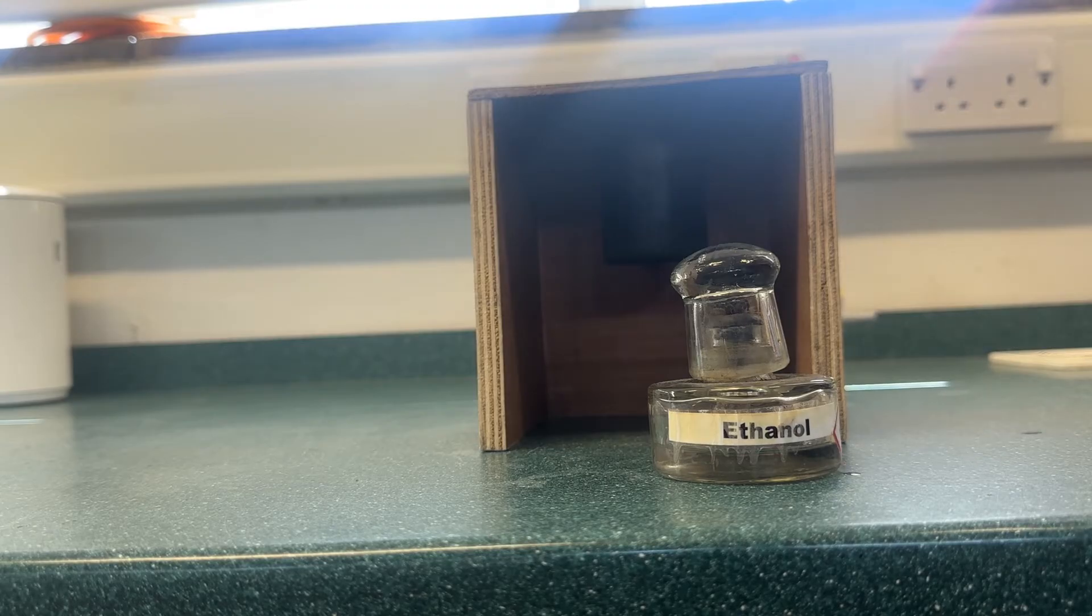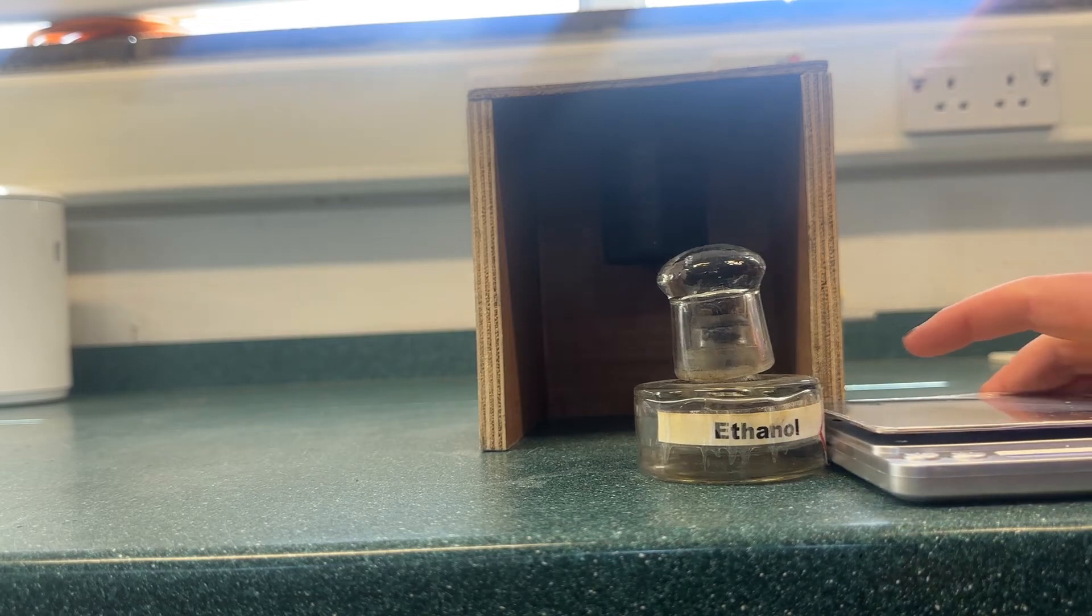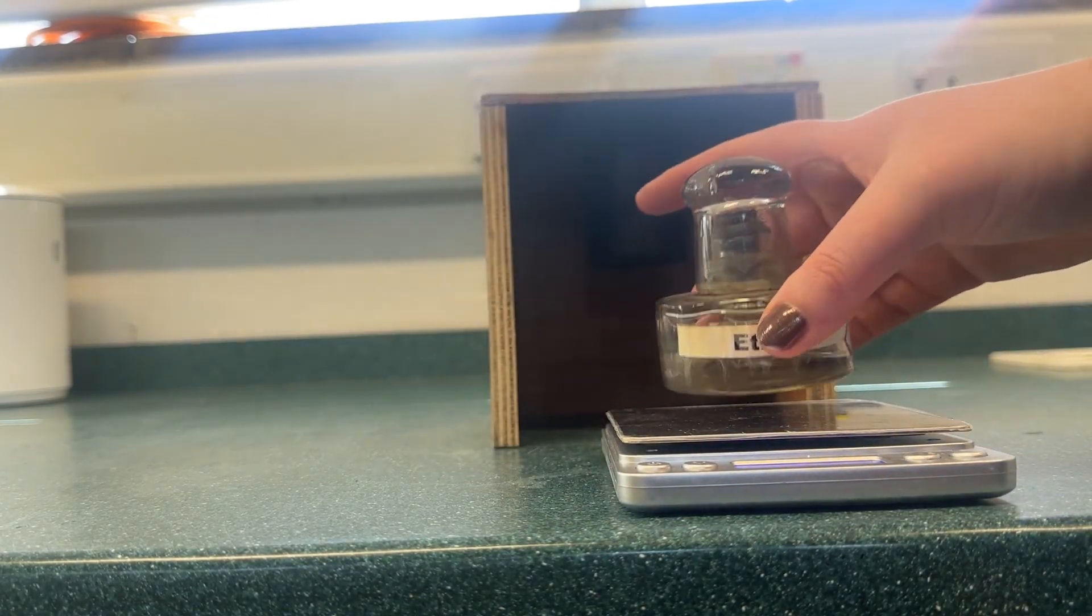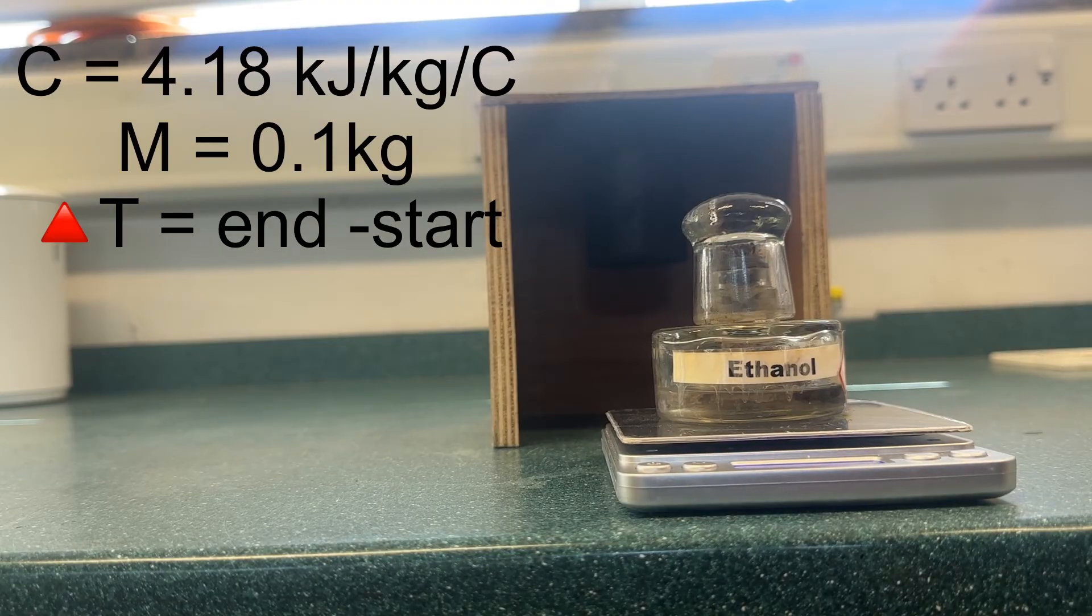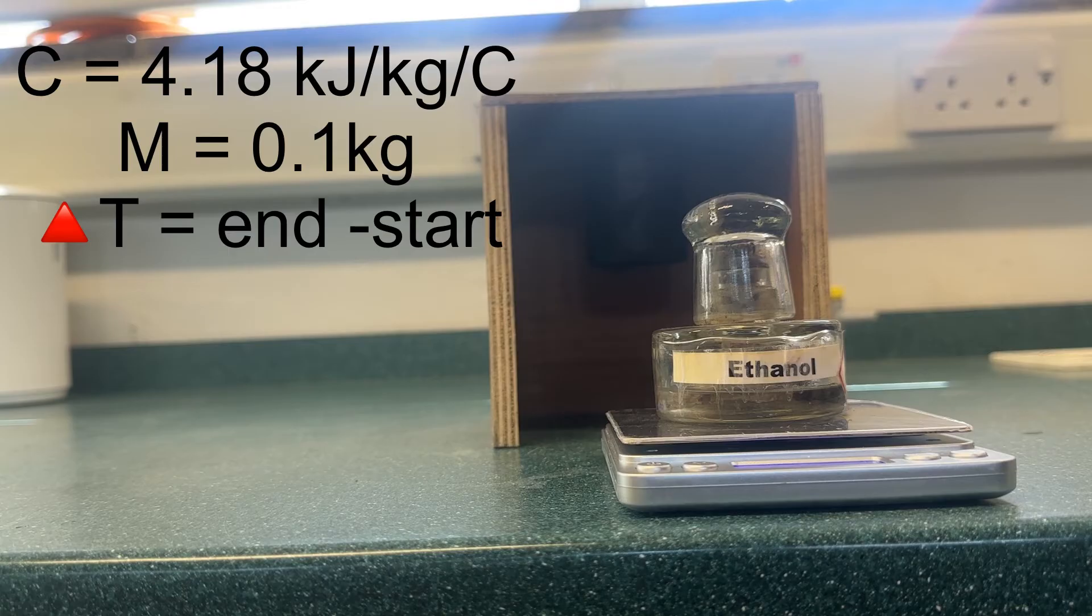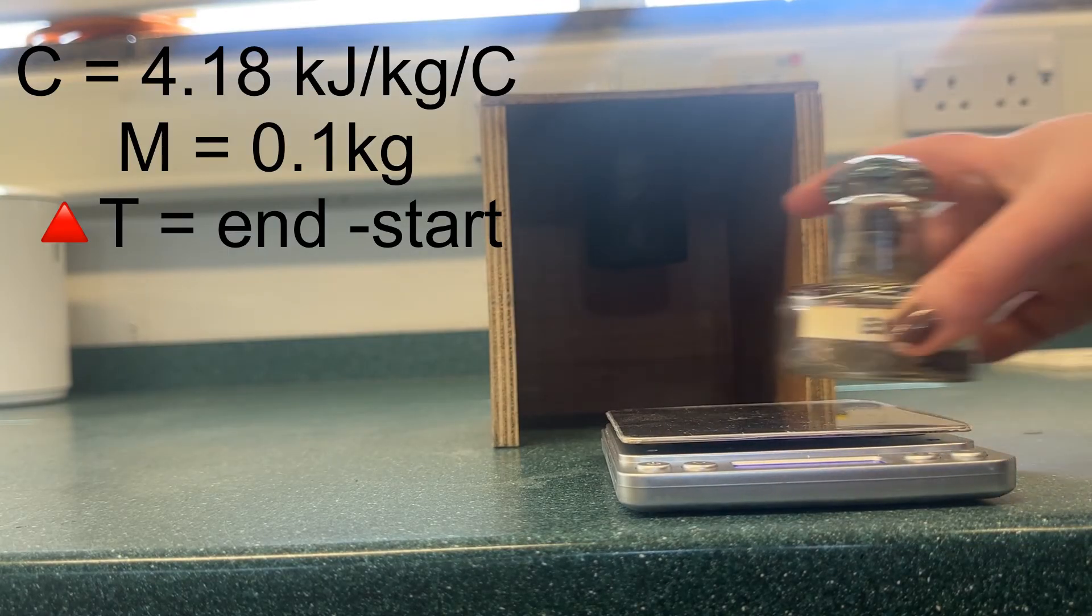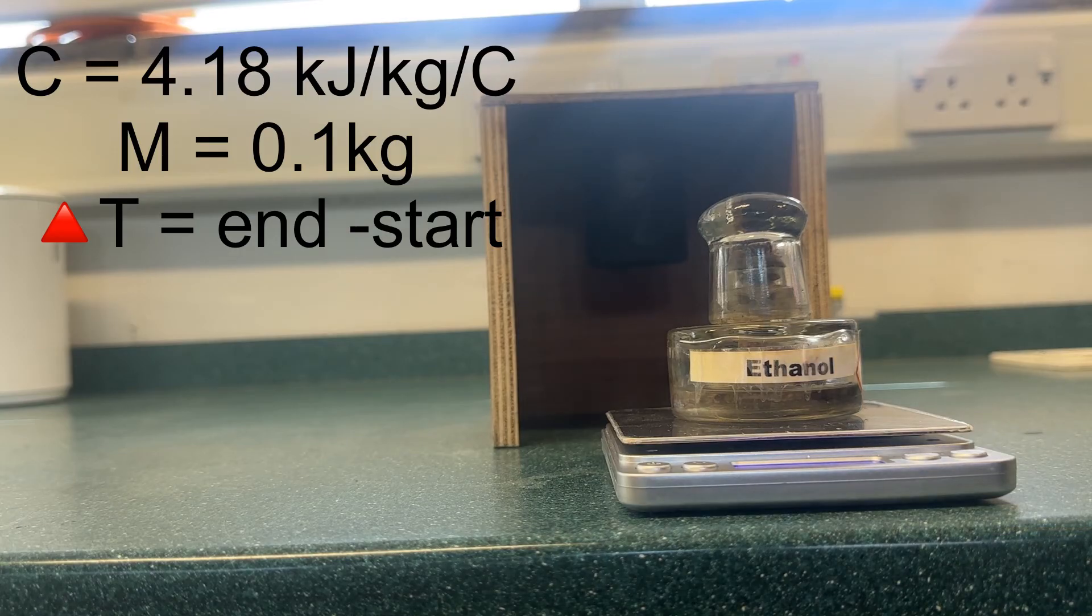At this point you will now have all the information required to calculate the energy released when burning the alcohol. C is 4.18 as we are heating water. M will be the mass of the water in kilograms, in this case 0.1, and delta T will be the difference in temperature: the end temperature minus the start temperature of the water.